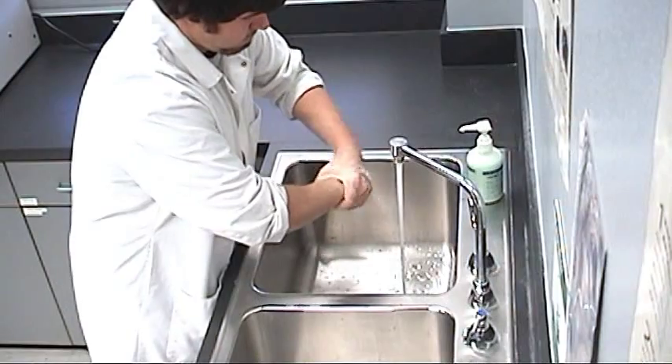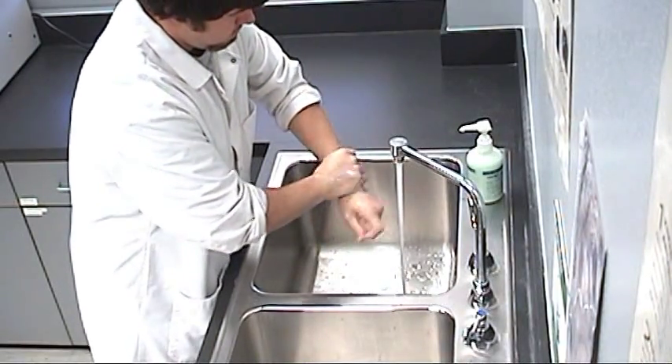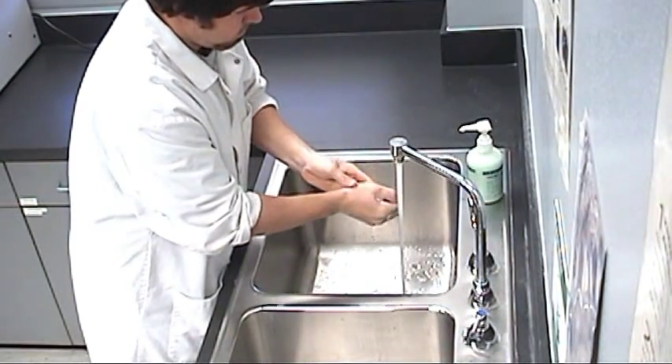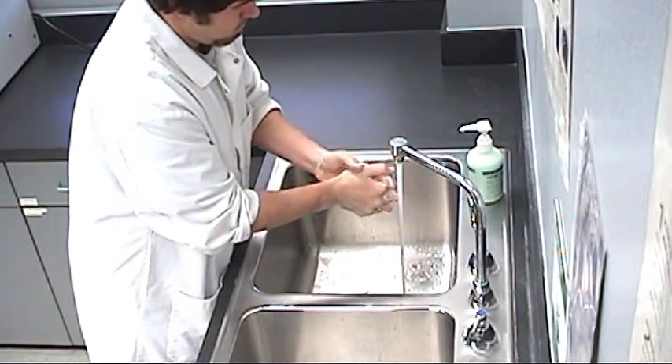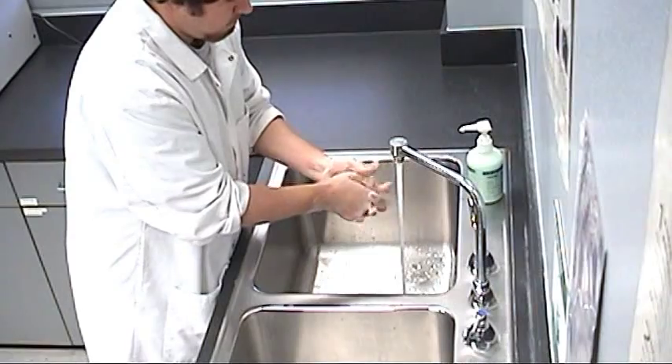Handwashing is the primary method used to prevent transmission of infectious microbes. Handwashing should be practiced before and after your time in the lab, and anytime your hands become contaminated during lab.